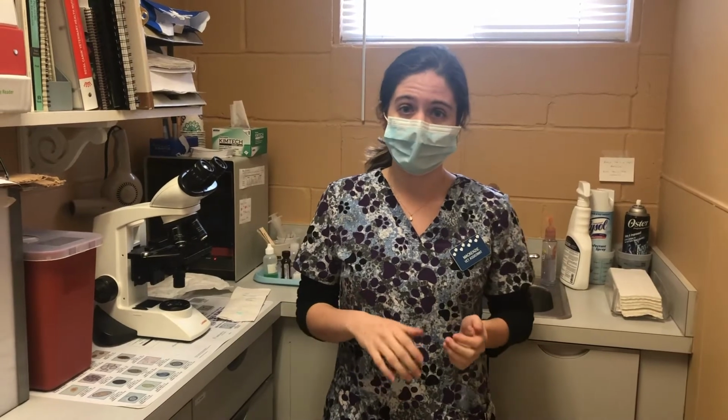Okay, so before I go about staining my slide and looking at it under the microscope, I'm going to quickly go over the 4 stages of estrus, give you a few clinical signs and signs that you would see under the microscope. So the first stage is called anestrus, and depending on your textbook, it can also be called diestrus. And there's not very many clinical signs, but under the microscope, you'll see basal and parabasal cells, and sometimes some intermediate epithelial cells as well.